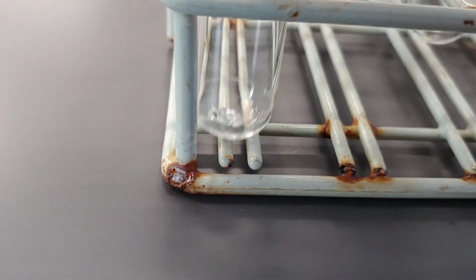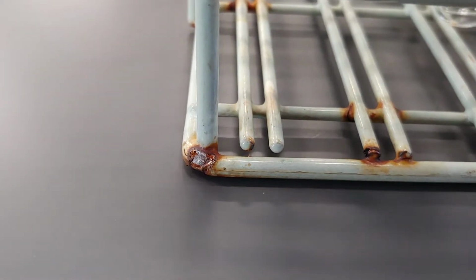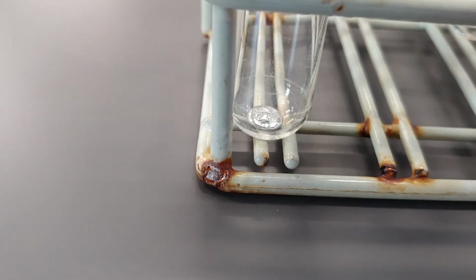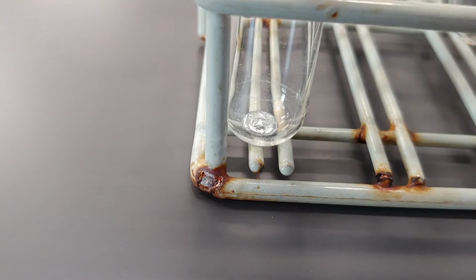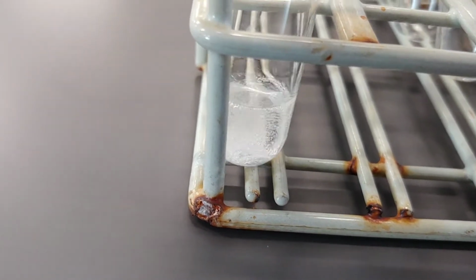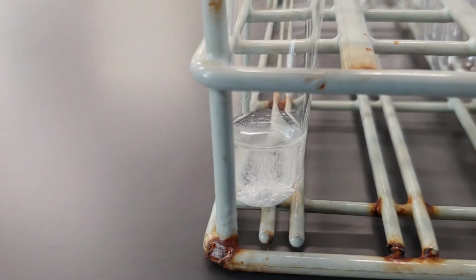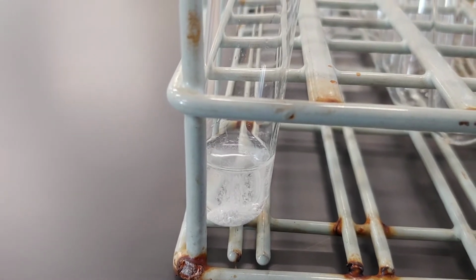All right, reaction number 2 is solid zinc metal. You can see there's the solid zinc metal, and I'm going to add hydrochloric acid to that. Here we go, zinc metal plus hydrochloric acid. And there you go, zinc metal plus hydrochloric acid.